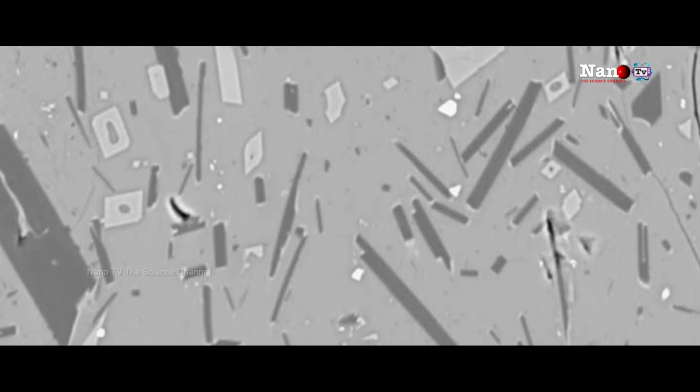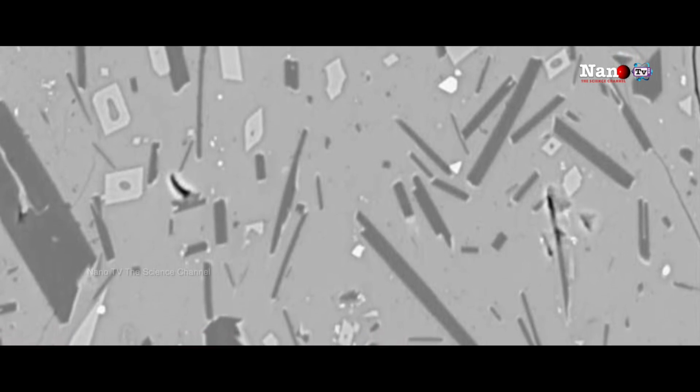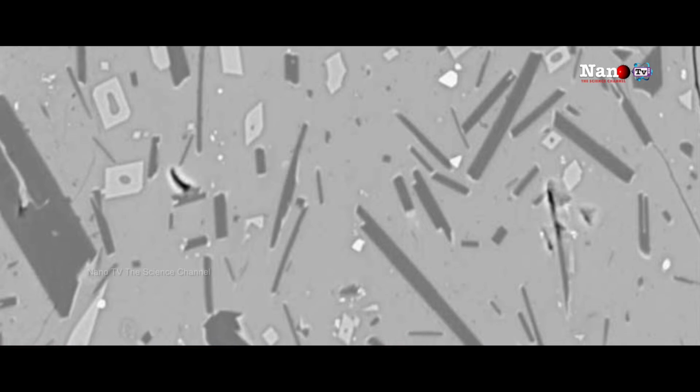The second one is called backscattered electrons, which go towards the nucleus. You must be remembering from your school days that the nucleus consists of neutrons and protons that reflect the electron, so it tells you what type of material it is. That means you can find out what that material is. Suppose you have two different materials, aluminum and titanium, you will get two different contrasts, and that is called a backscattered image. So these two types of images are very essential to characterize the surface of any material.